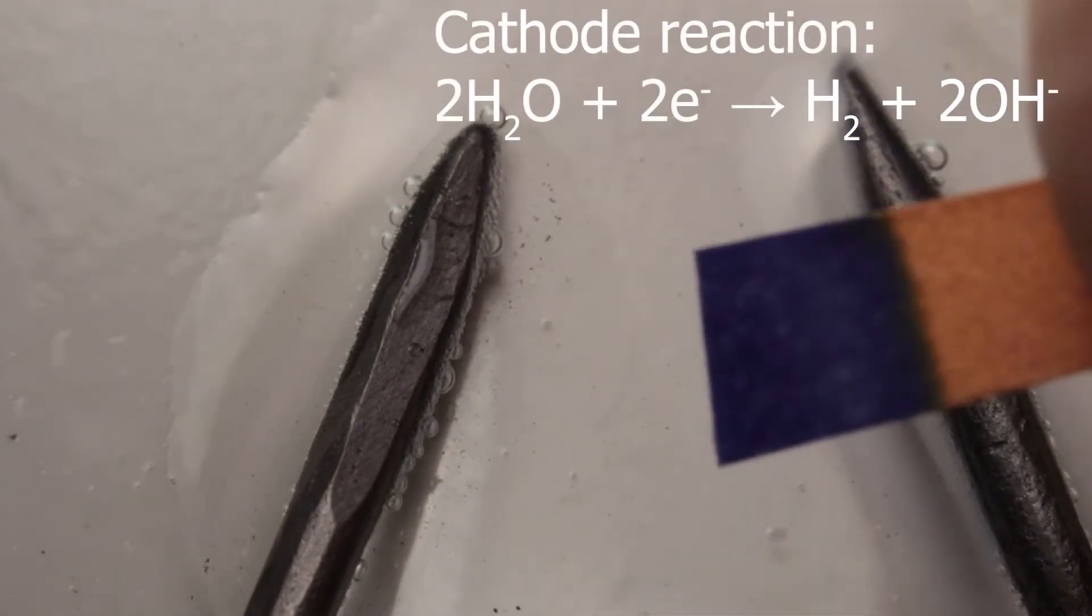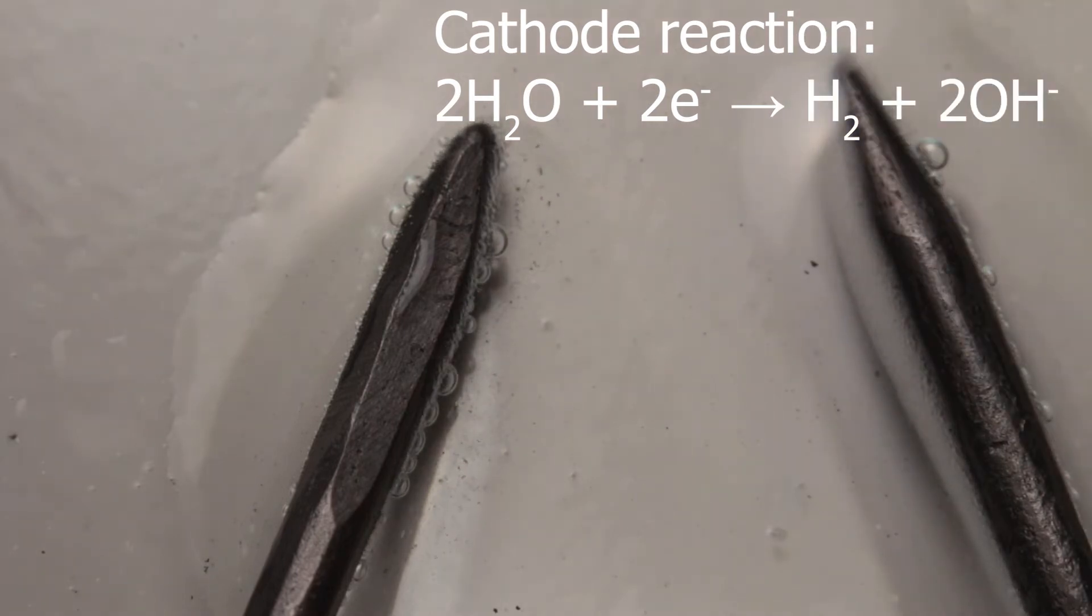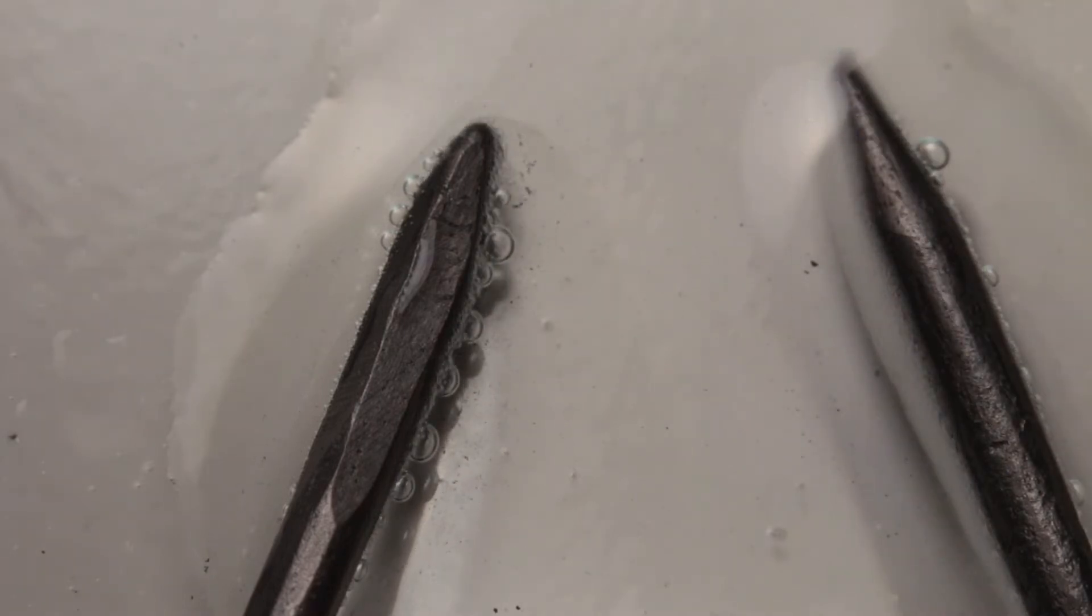You see I am testing it with pH paper. It turns blue, which means presence of hydroxide ions is detected. In fact at cathode, water has been reduced. Hydrogen gas is formed and hydroxide ions.